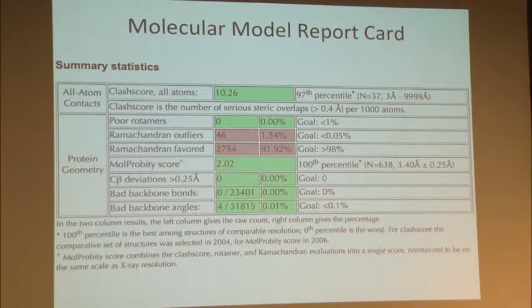In fact, when you use these criteria, many of the cryo-EM maps actually rank quite highly. One thing you may not be surprised by is that because we actually get the phase information, the map may not be as so-called high resolution as it could be, but it is a very accurate determination.